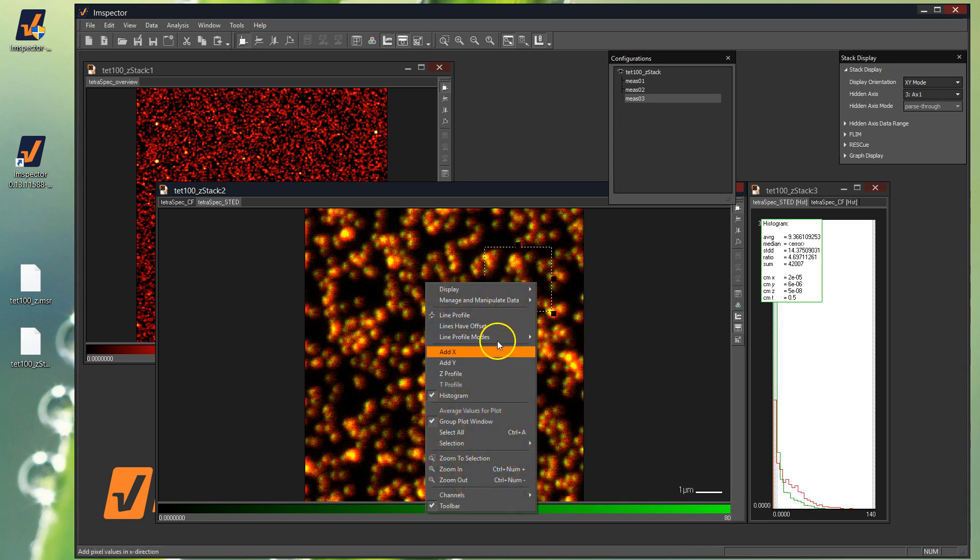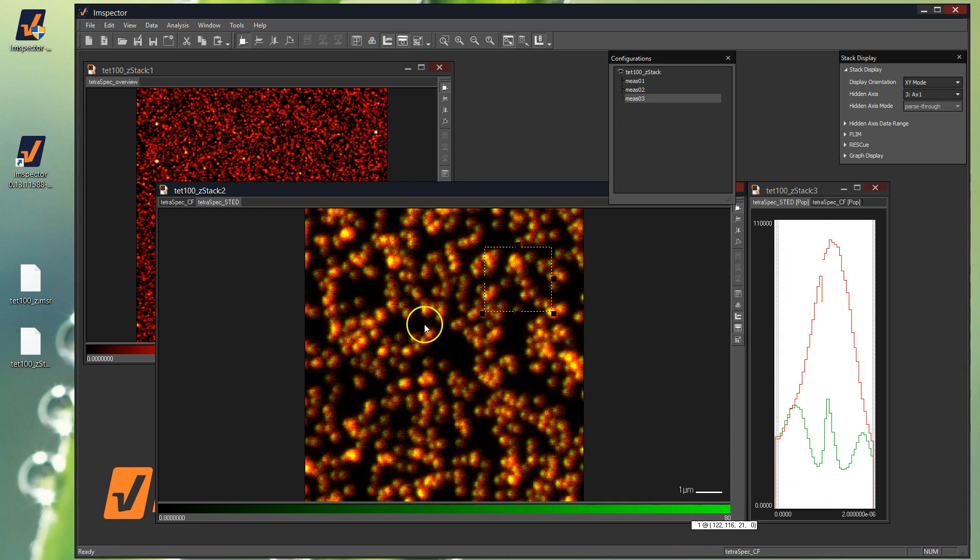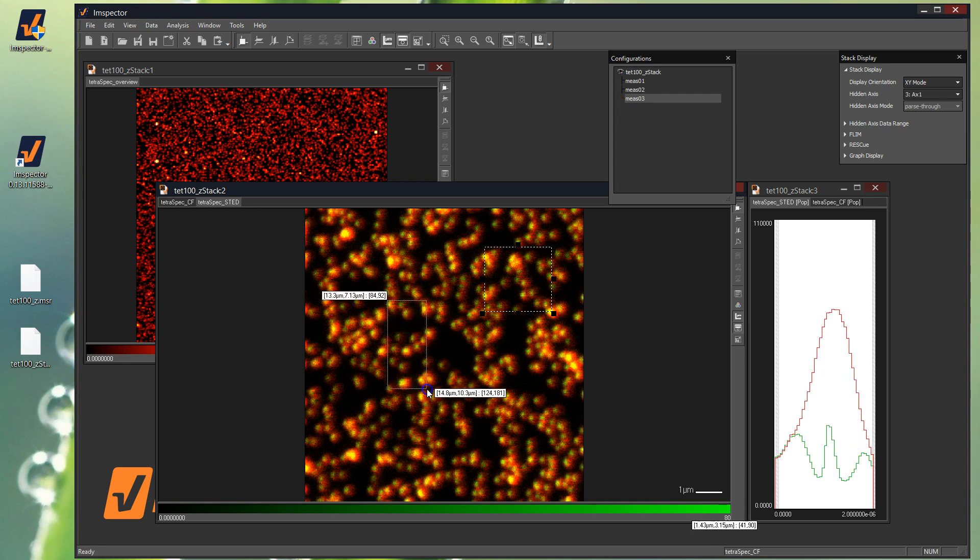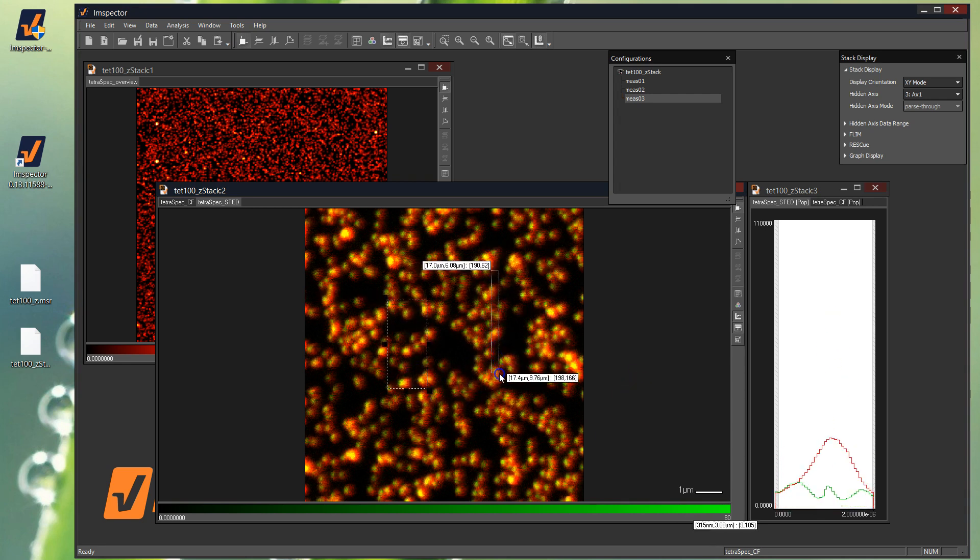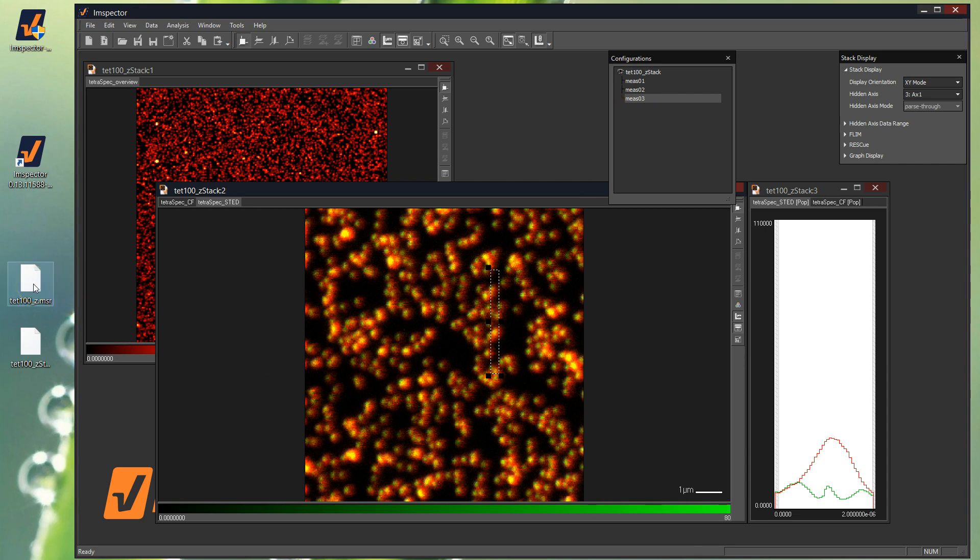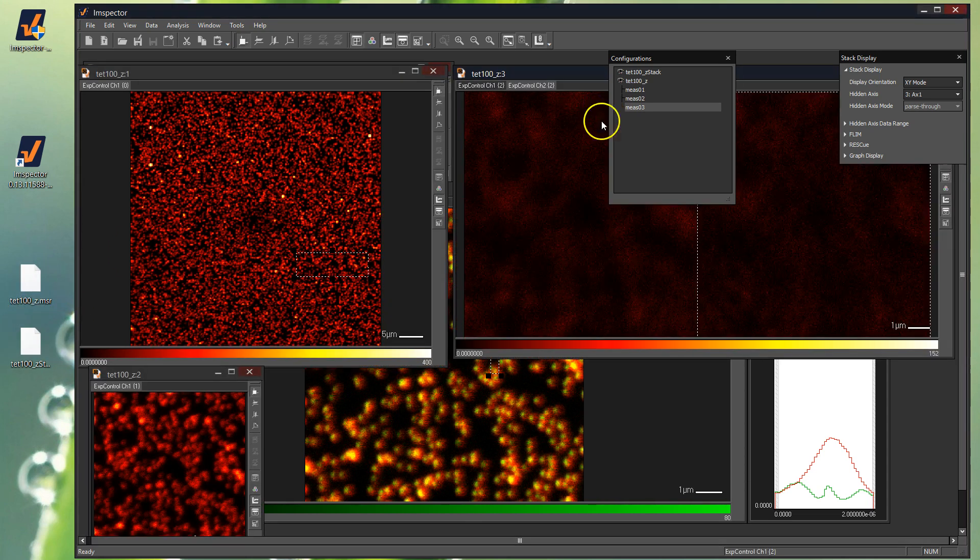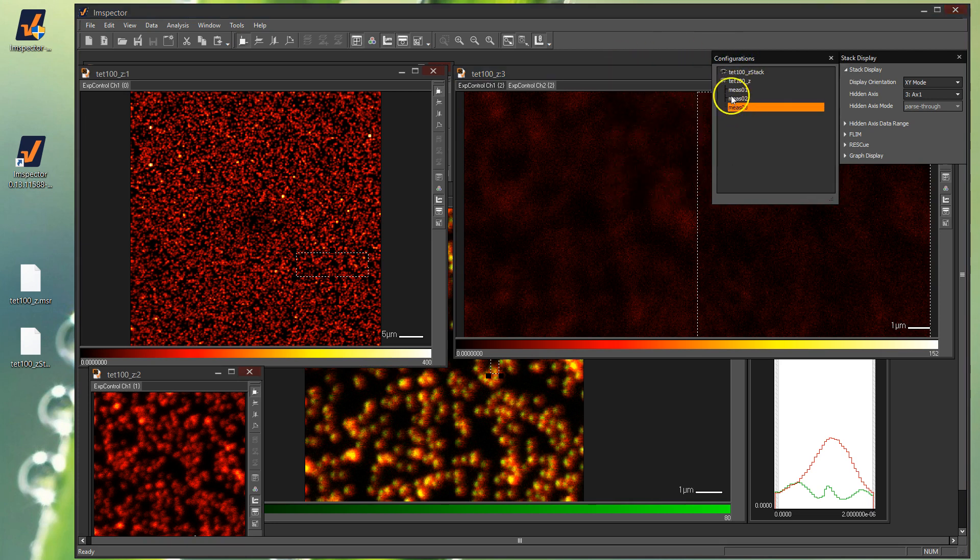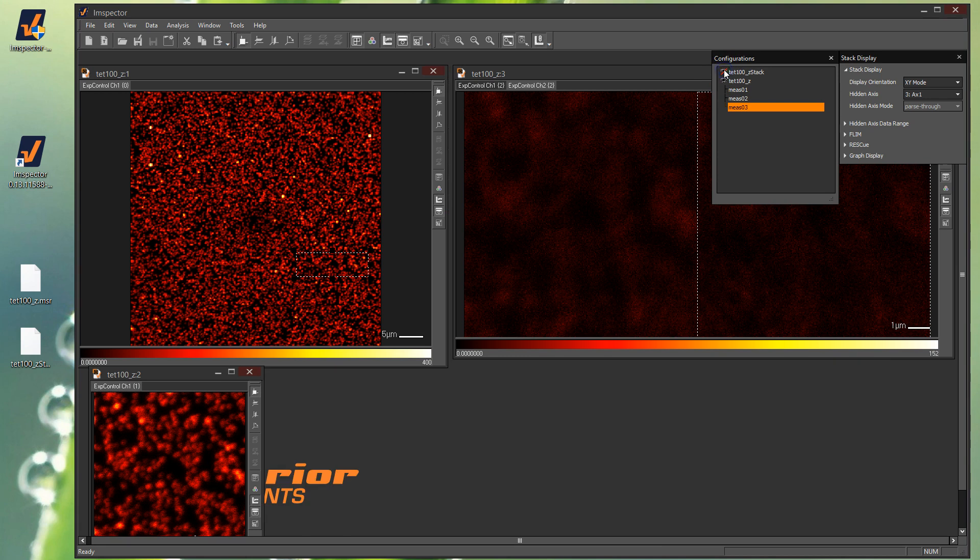Or you can change it to, let's say, a Z profile and get a Z profile down a certain section however you need to through the beads, or your sample in your case. And so that's one part. And if you add more of the MSR files to the inspector, you can see them here in this configurations window.